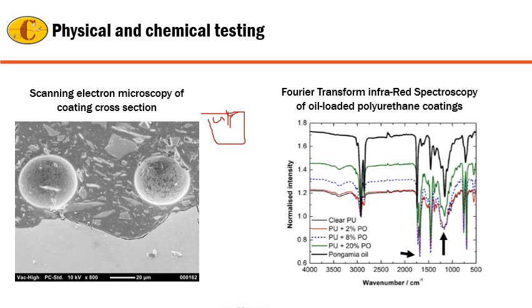In the FTIR also there are a few other types as well. So in this case you can go to see if the coating has degraded. If your coating has degraded because of UV rays or sunlight, the bonds that break will be different. If your coating has degraded due to rainfall, then the bonds that change that are seen here are different. So that is one way of figuring out what it is that is causing the degradation of the coatings.